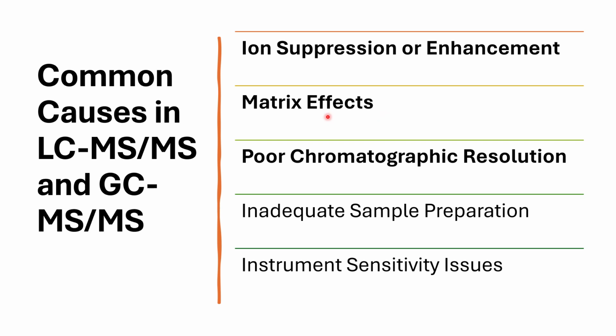Second, coming to matrix effects. Matrix effects can completely mask your analyte. High salt, biological matrices, lipids, or proteins can cause significant signal suppression. In GC-MS-MS, non-volatile matrix components can contaminate the injection port or column.